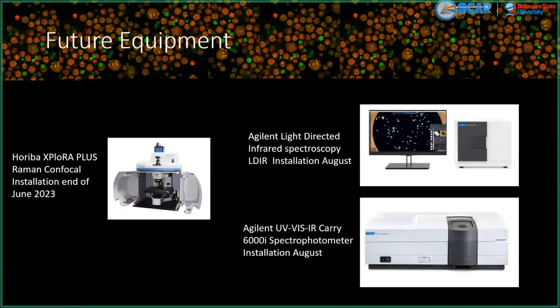This is where confocal is probably going to migrate to in the next 10 years, where we will be using more Raman scattering as a way to detect samples that aren't labeled. You do not need labeling for your sample when you're using these techniques. So if you have a protein library for Raman spectra, you could literally do a confocal scan of your sample, collect that and label all those proteins that came up within that Raman map. If you wanted to look at protein-protein interactions, you could then start parsing out the different spectra that come from that Raman confocal map and seeing what is correlated together and what is not.